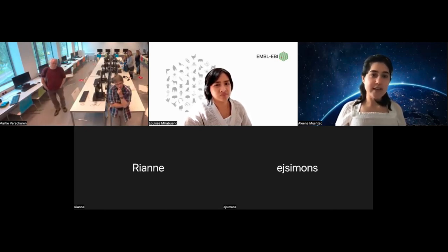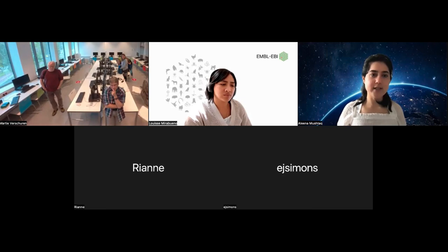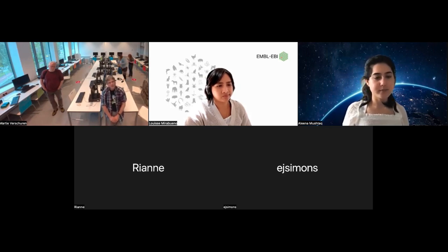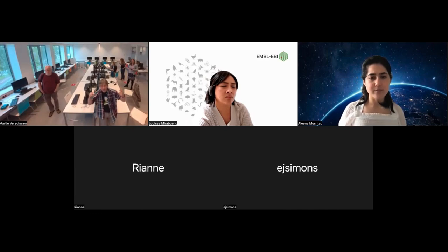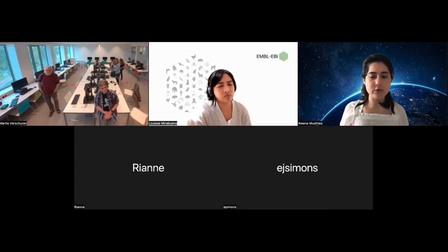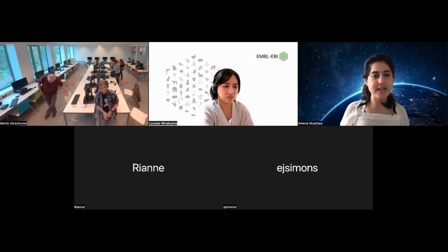I'm not sure, actually. This is something that I would have to relay to the annotators to ask them. We obviously have a BLAST tool in Ensembl, which can also be used, but I don't think we have any specific tool for primer designing. No, but if we can just put primers in a BLAST for a certain gene, and it will come back with where these primers are in the different exons in the transcripts list, then this would help also. So you do get a table with Ensembl BLAST that gives you different information on the different hits that you might have.